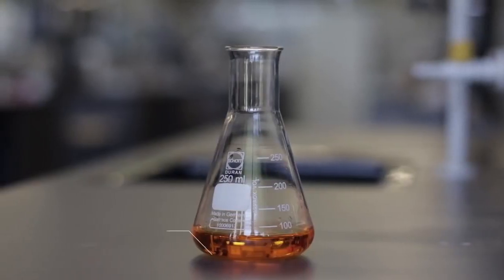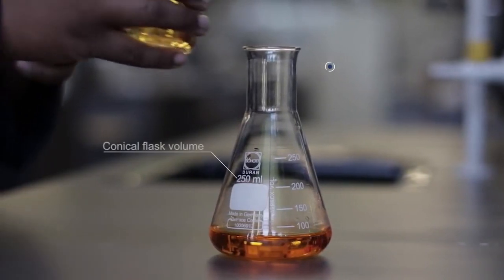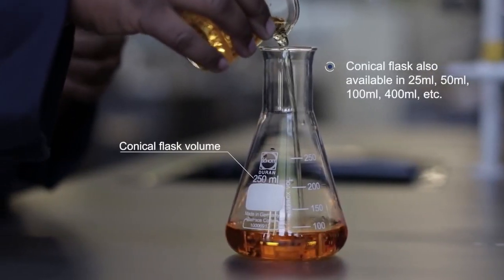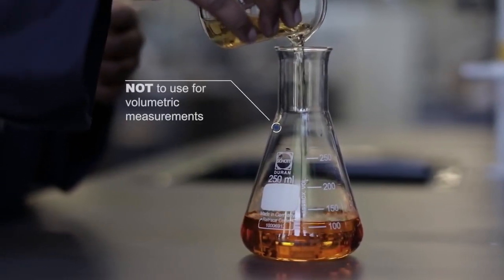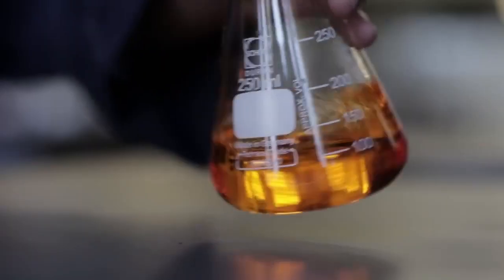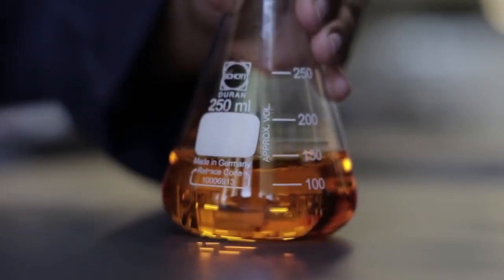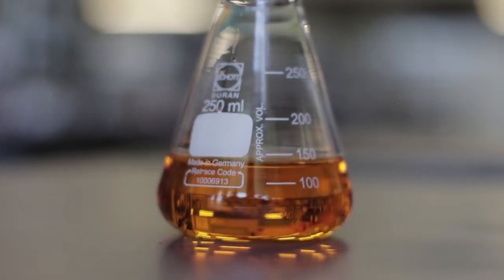A conical flask possesses a flat base, conical body, and a cylindrical neck. It is found in different volumes. This glassware is also not for accurate volumetric measurements, but is used to mix contents by swirling without the risk of spillage. One example of its use is during a titration.